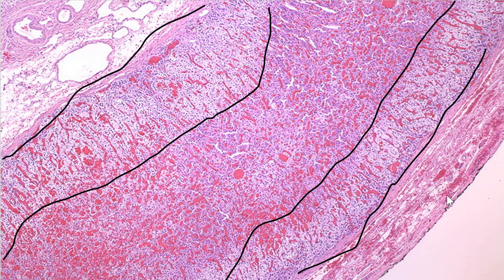So we know that this is our apical surface here, right? So the first one that's out to the world is our glomerulosa, our zona glomerulosa. Don't forget zona.